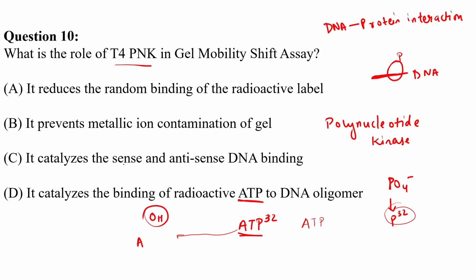Okay. So basically, the question was, what is the role of T4 PNK in this gel mobility shift assay? So I hope you understood the gel mobility shift assay, right? Yes, ma'am. So in this assay, we are visualizing this DNA, right? DNA bound to the protein.